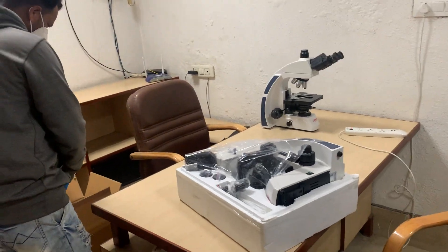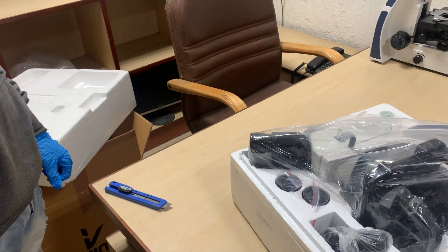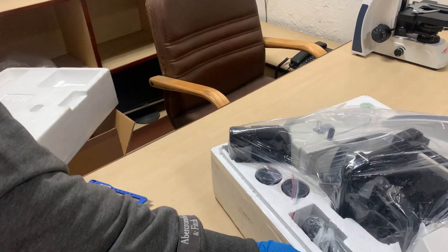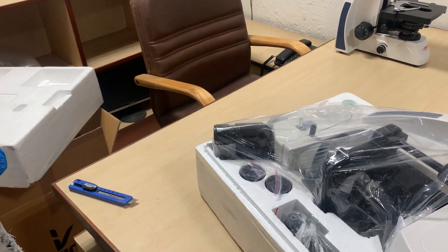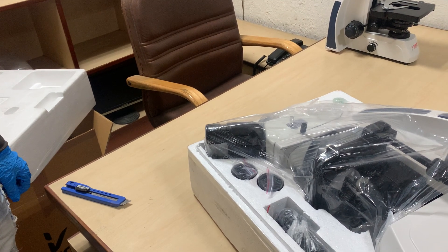You will be receiving the microscope in a condition where the head is packed separately and the optics are packed along with the microscope, so that the microscope is parafocal and paracentered.